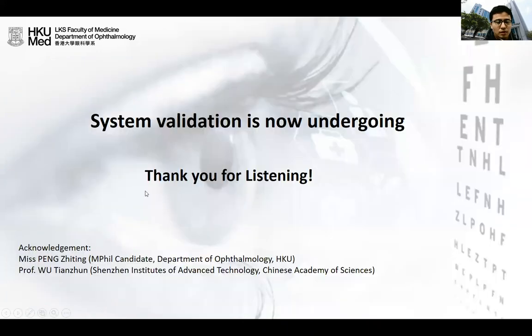Currently, we are validating our device using a commercially available digital ELISA assay kit. Here, I would like to thank my student Ziting, who is working on the project, and my collaborator, Professor Wu, who provides us the technical support on the device fabrication.